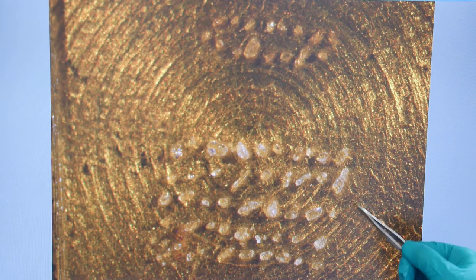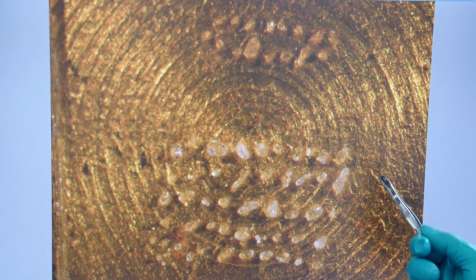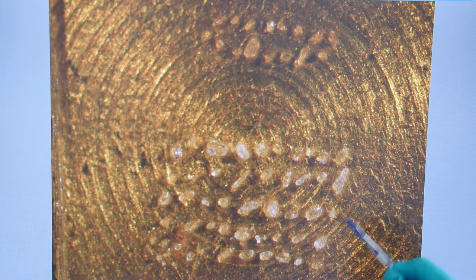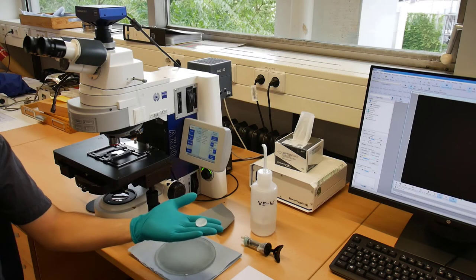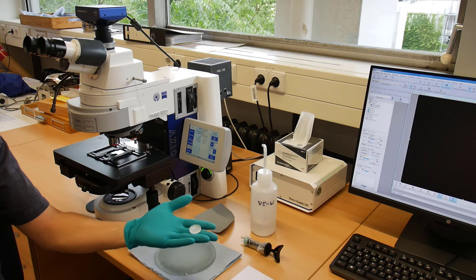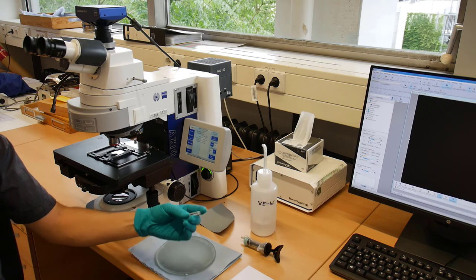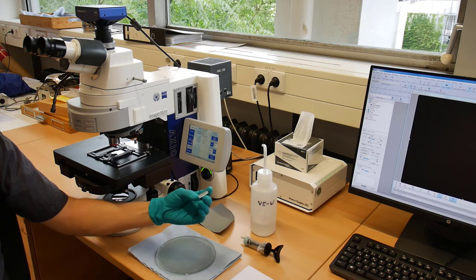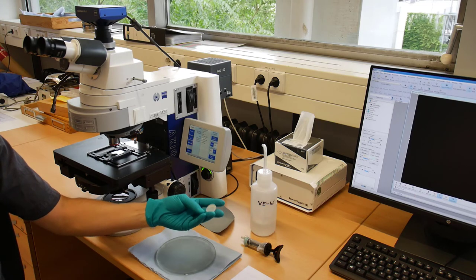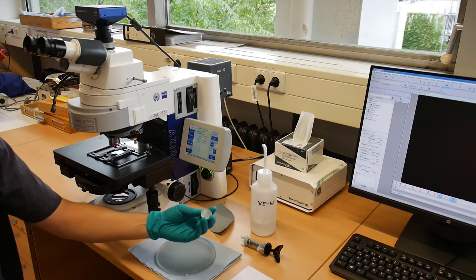Now we can pour the epoxy on our mount. In this case we will take it to our thin section lab and they will do it for us. A couple of days later we can have it back to proceed with the polishing. We got back the epoxy mount from the preparation laboratory. In this case this mount has been cut to the correct thickness for SIMS analysis, which is between 4 and 5 millimeters. It's unpolished and we will show you how to proceed with the polishing.